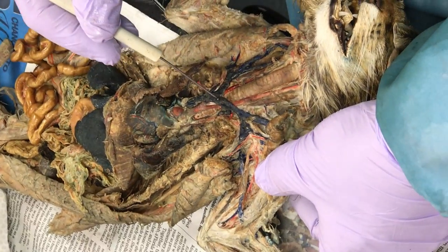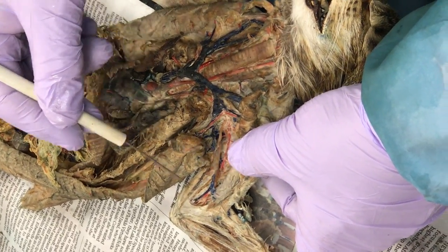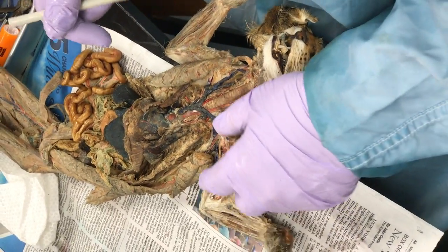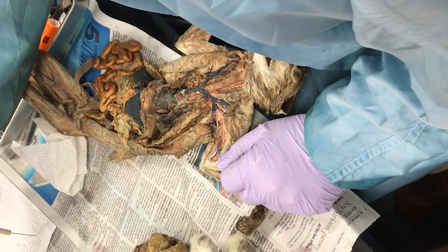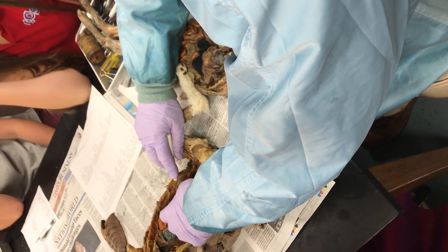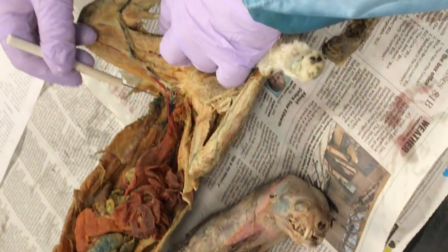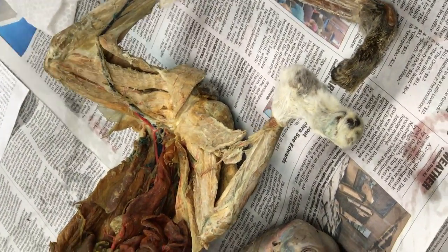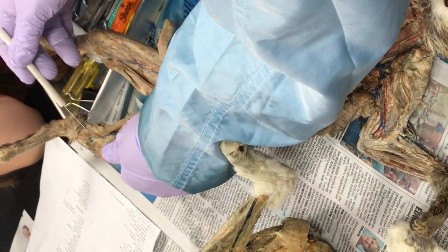Pin-wise: superior vena cava, innominate, external and internal jugular, subclavian, axillary, brachial, radial and ulnar. The ulna goes to the elbow — ulna to elbow, you can memorize that. The radial goes the other direction. We also have the femoral — blue, red, right in there along the femur. The saphenous goes all the way down to the ankle. There's the saphenous vein — you can't miss it.